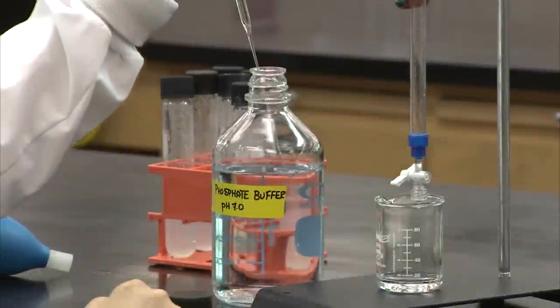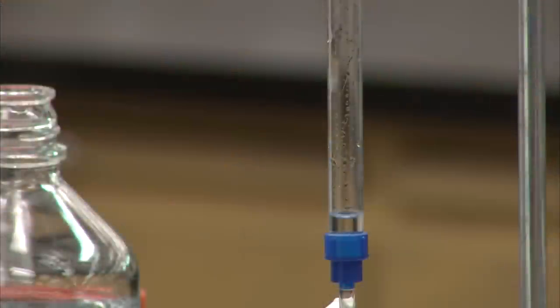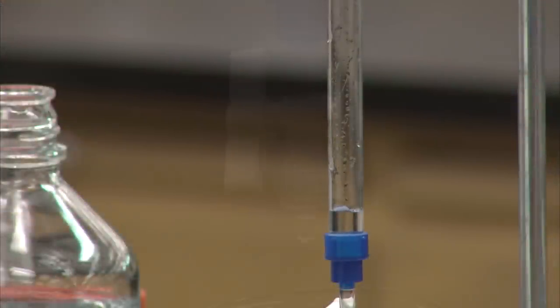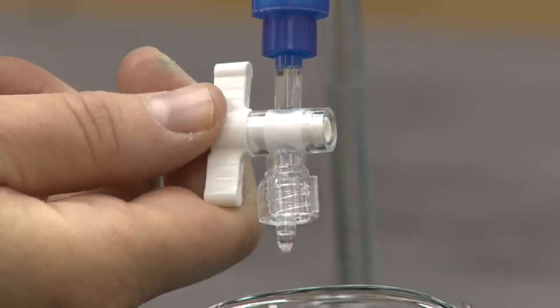You are now ready to pour the column. Because we wetted the column with water, we will rinse it with some of the same buffer used for the mobile phase of the experiment. This is passed through, and now we are ready to pour the gel.